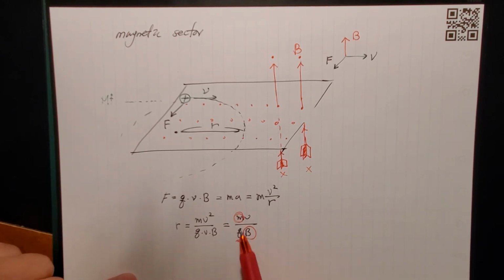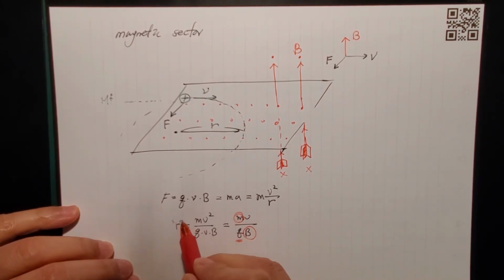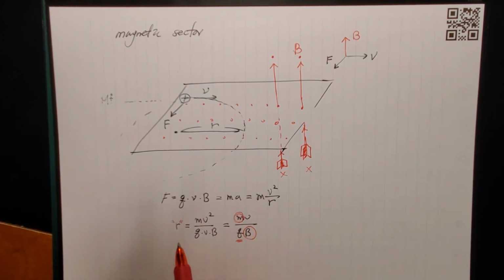And also, we know as we change the magnetic field, depending on the mass, the R changes, right? So there are 3 variables, and that's not good for us. So we have to fix one of the variables, in this case R, okay? For the magnetic sector, we are fixing R. And as I explained about the analyzers earlier, there are other tools where we don't really fix the variations.